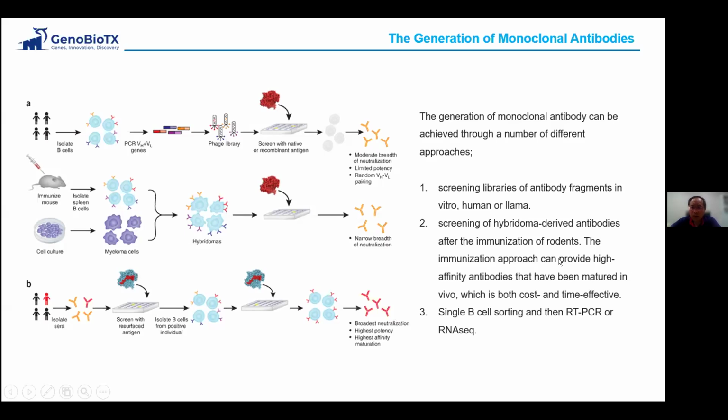Of course, the hybridoma approach can provide high-affinity antibodies that have been matured in vivo, which is both cost and time effective.